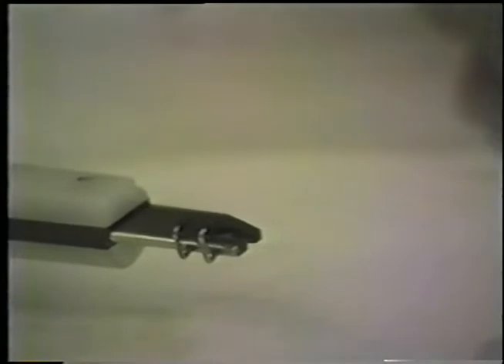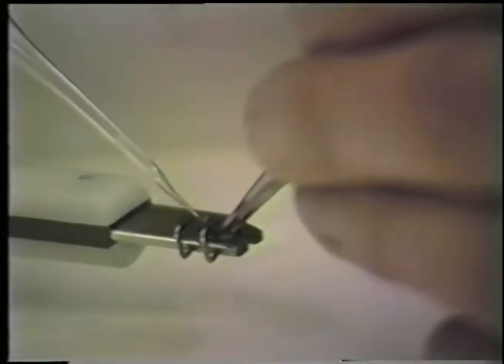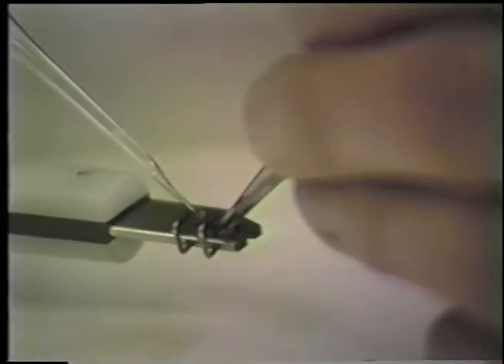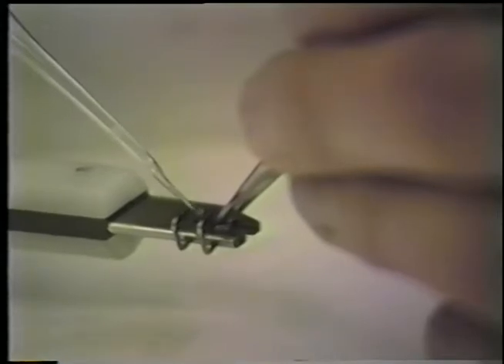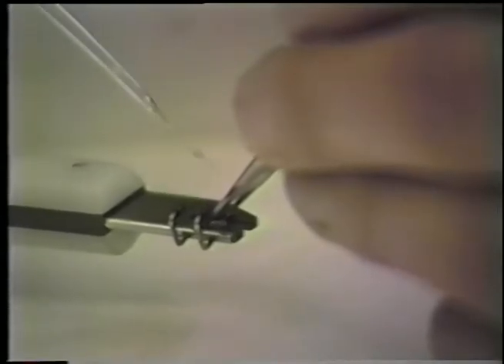It's necessary to hold the specimen carrier down with the forceps to keep surface tension from pulling the specimen carrier away with the pipette. And you remove the pipette.